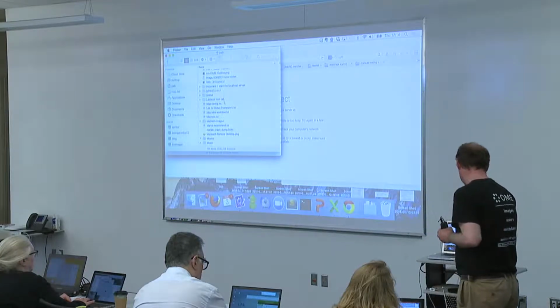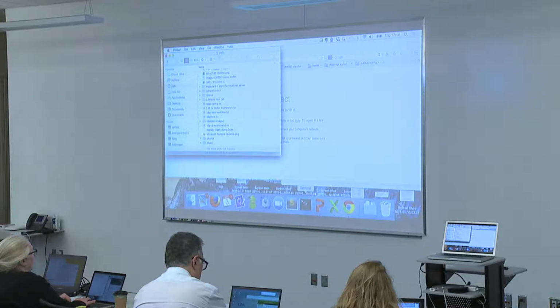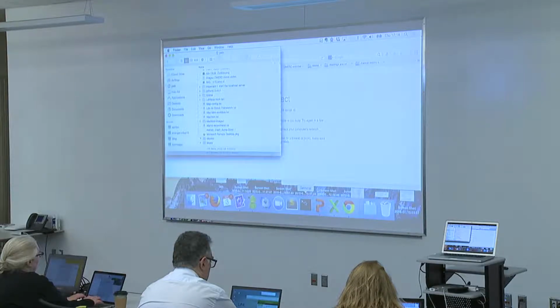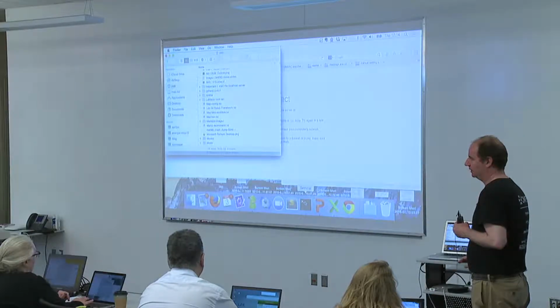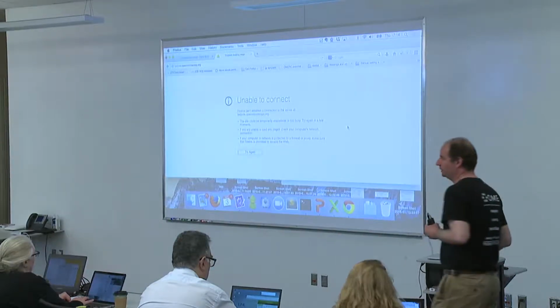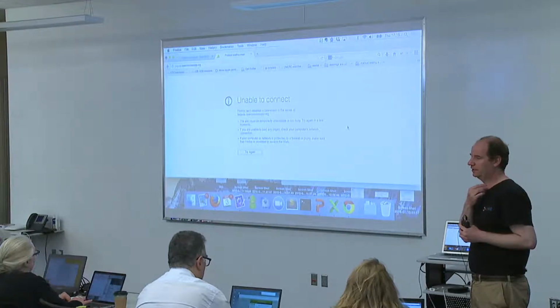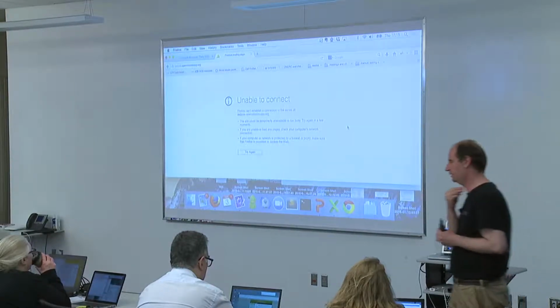All right. So I don't know what's wrong with the server. So maybe could you go back? Could you simply connect back to the normal internet and try to download those applications from the internet? The address to go to in the normal world is openmicroscopy.org, and then click on downloads, and there you download the plugin and the OMERO Insight.